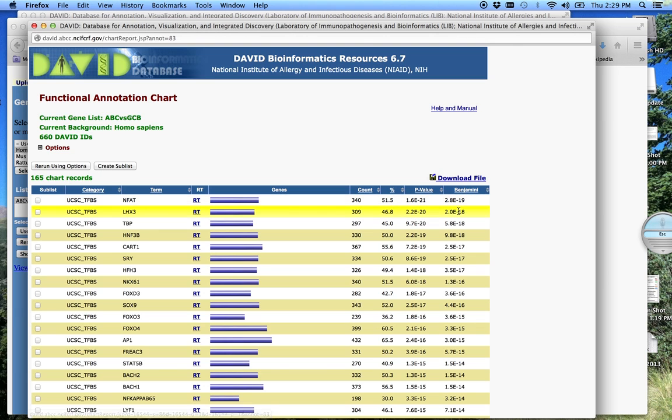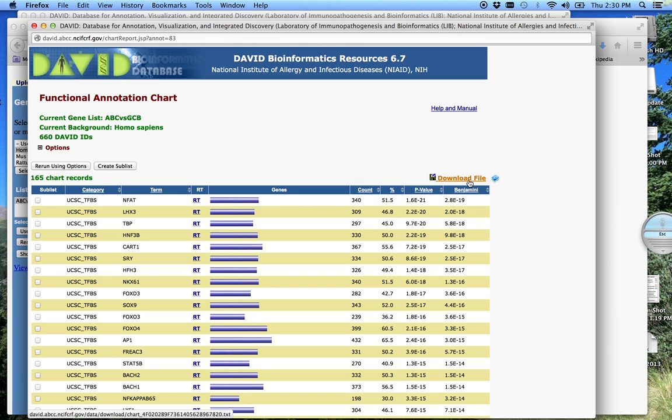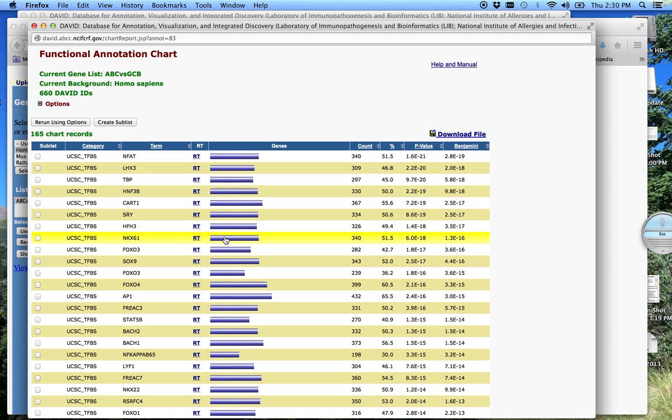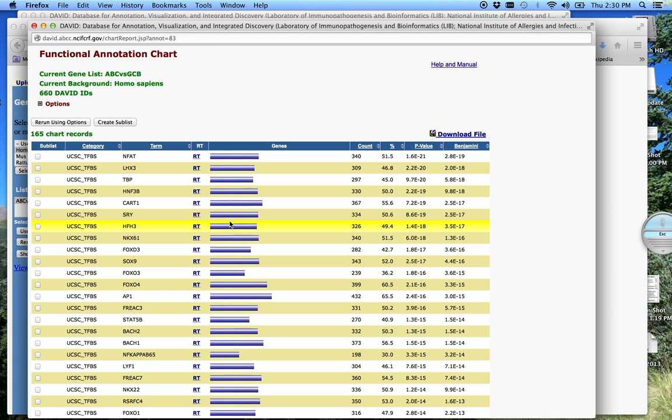Again, here's the Benjamini-Hochberg p-value. Again, you can download any of these lists at any point, and you can just go through this list and look for particular transcript factors and find those genes with a potential site for that. So this can kind of give you an idea of maybe some upstream regulators you might not know that are operating your system. This happens a lot. A lot of these transcription factors are activated by phosphorylation, removal of inhibitor. So you're never going to see it at the transcript level, but this gives you an opportunity to get to that level.